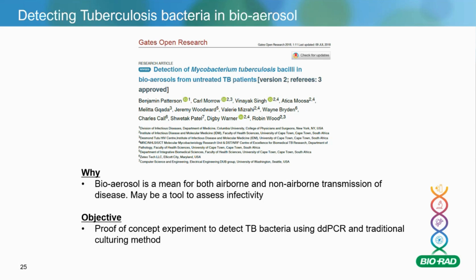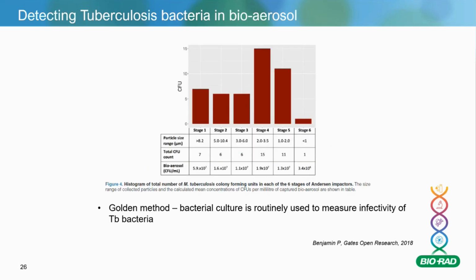They wanted to gain further insights into the airborne phase of TB and establish the bacillary concentration in exhaled bioaerosol. So here you can just see the different aerosol sizes and infectivity of those aerosol sizes with CFU units.